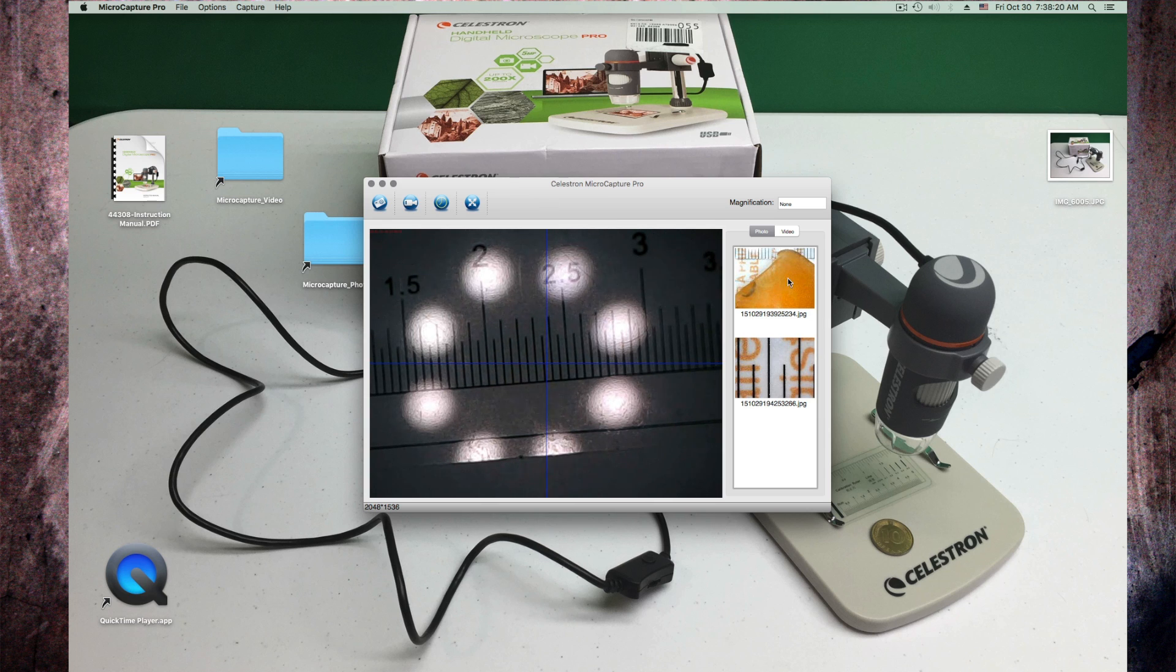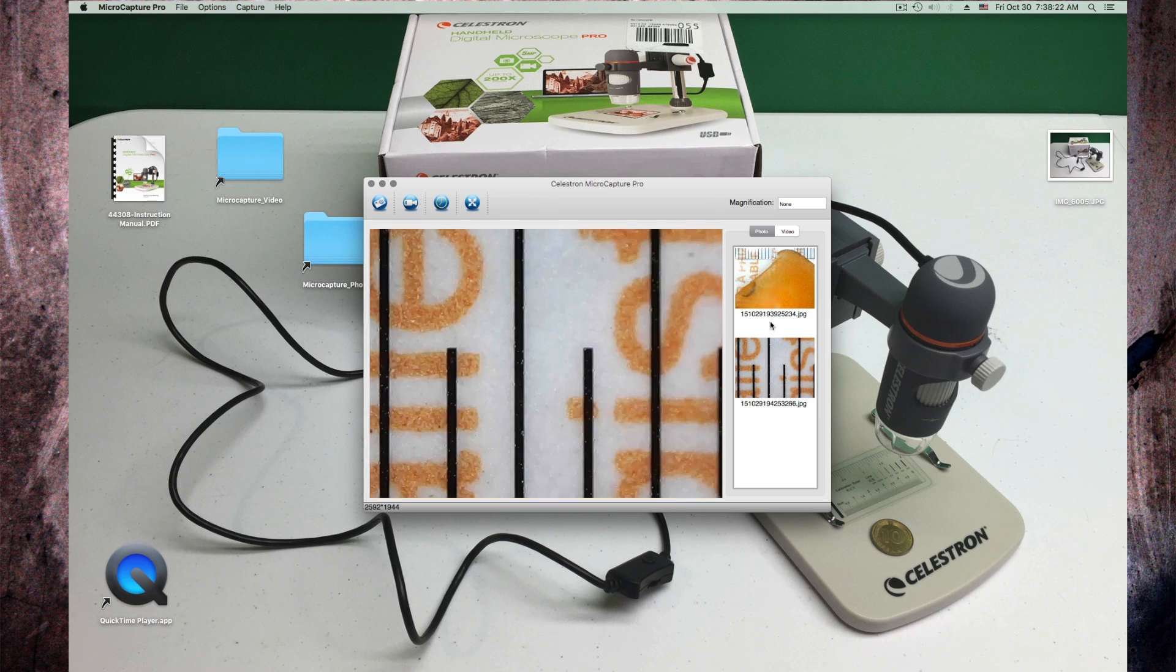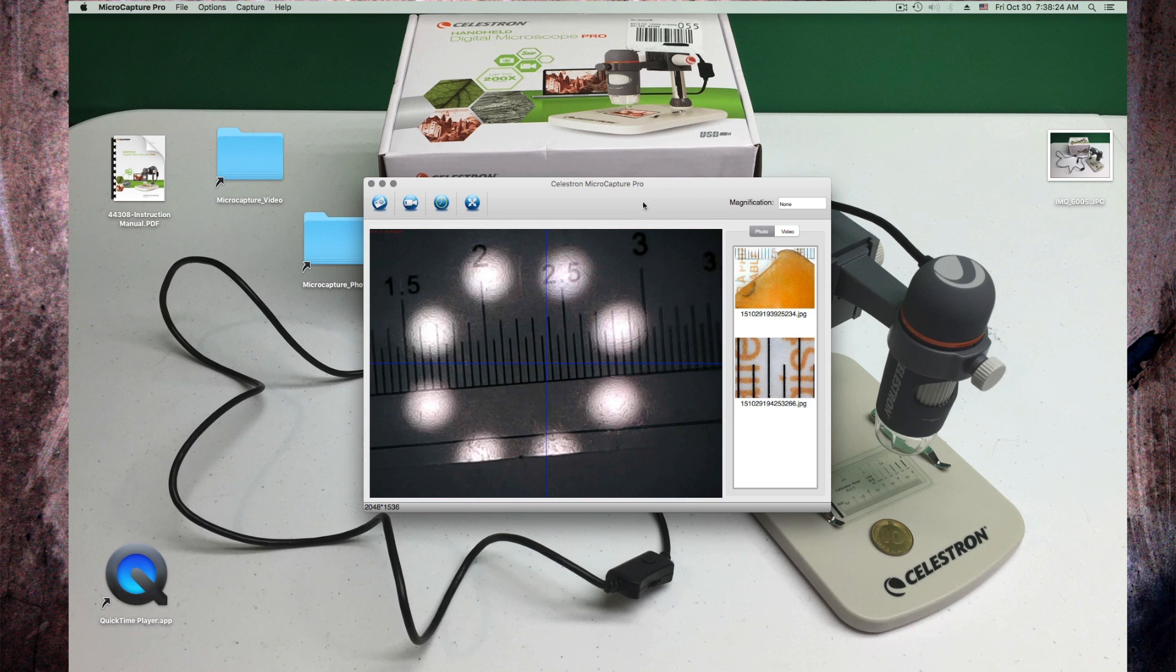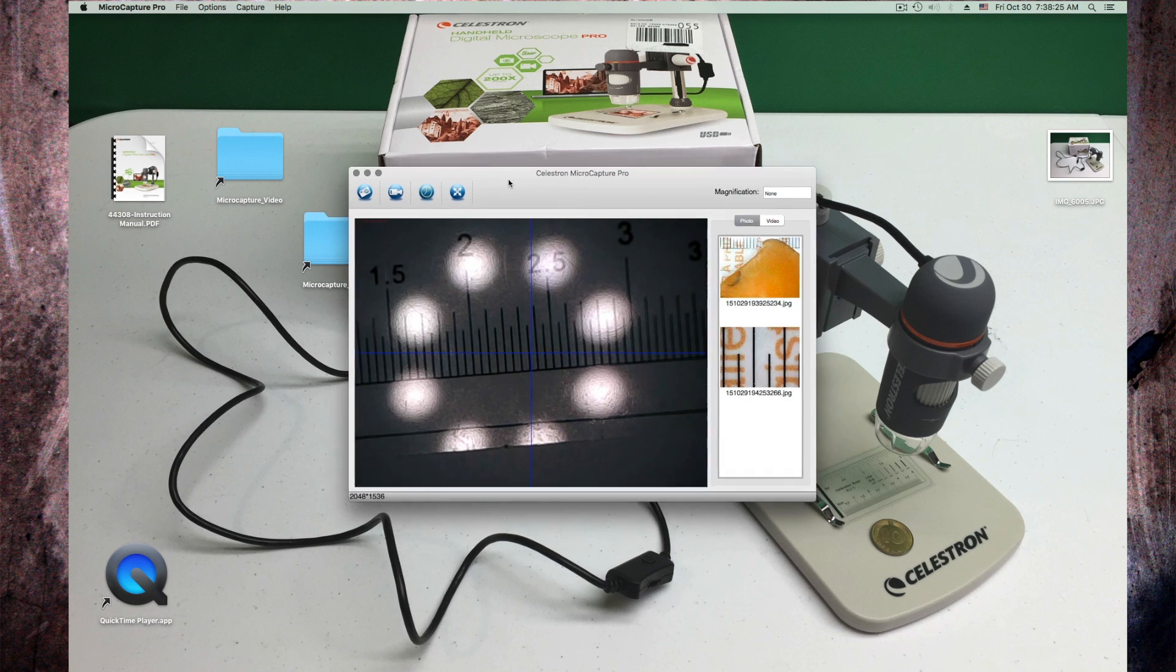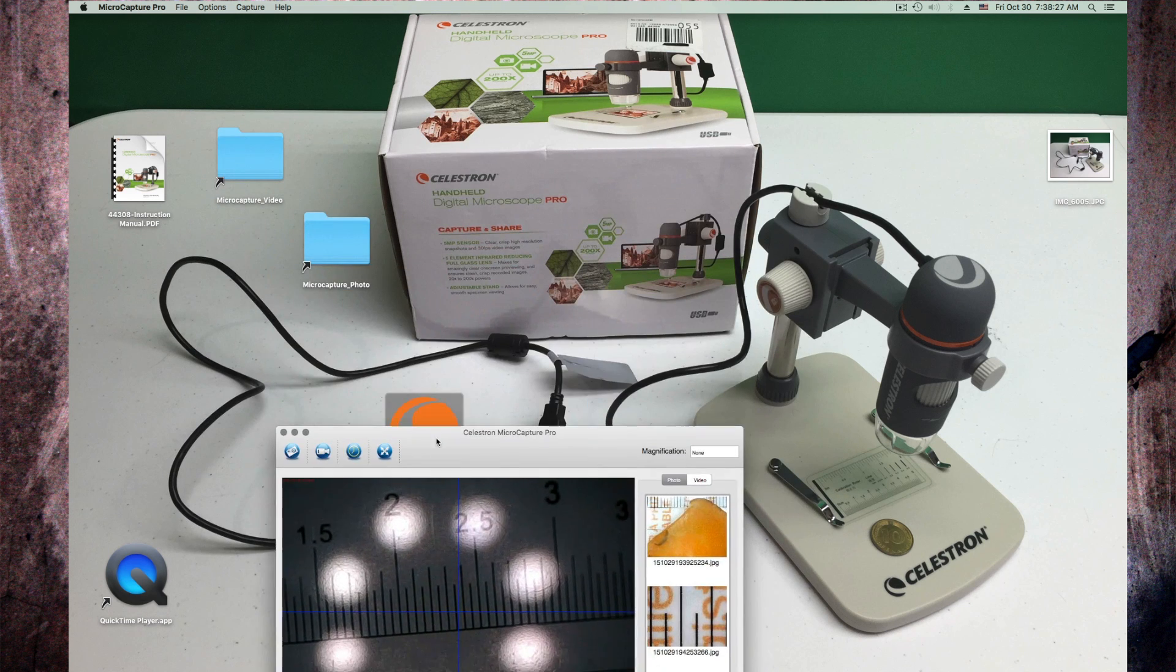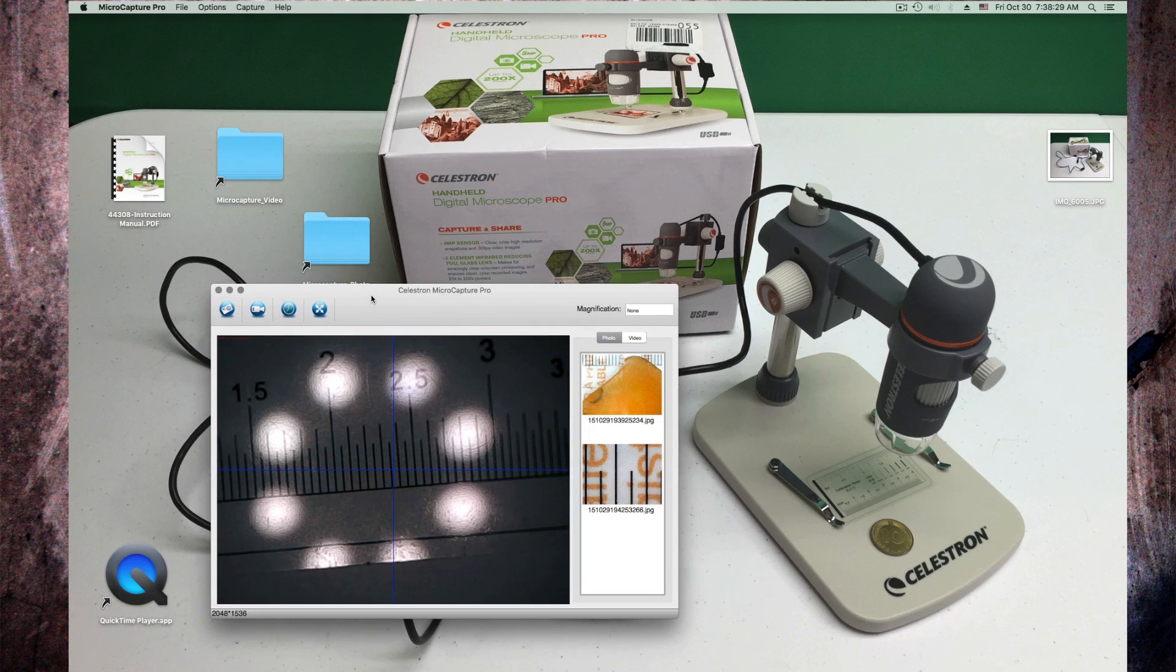I do have two previous pictures in here. Here I can move. I want to put this here or a little higher up.